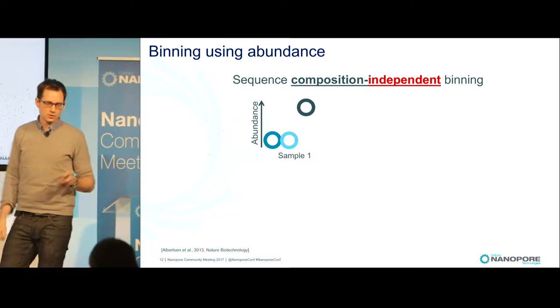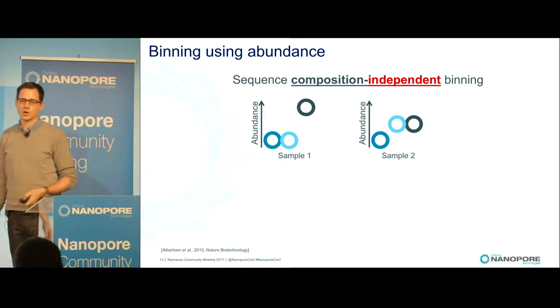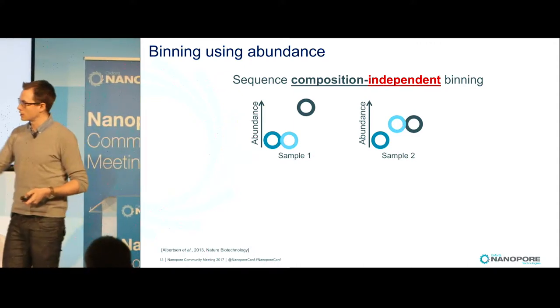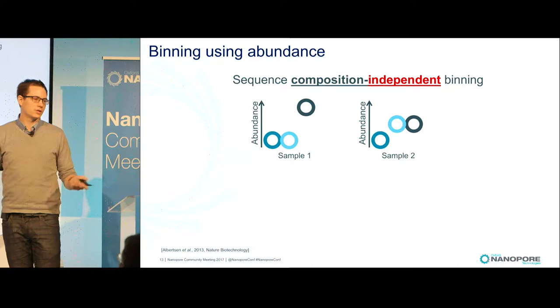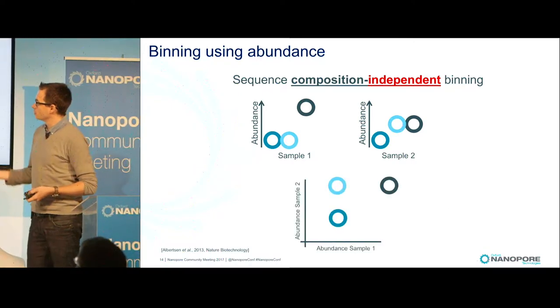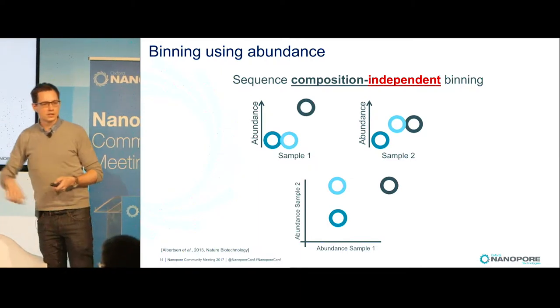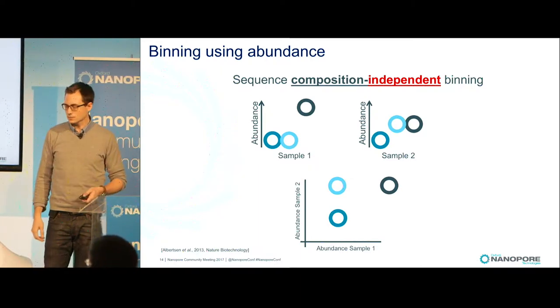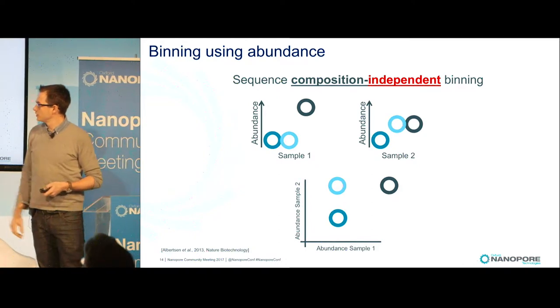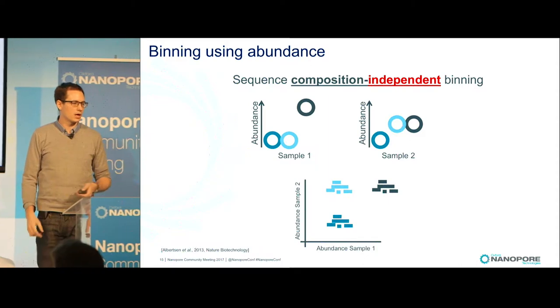They're hard to distinguish. So you make a simple trick. Just take another sample where they are in different abundance. This could be a different time point or just a location nearby or different extraction methods. Just generate differential coverage. Then you combine these two abundance informations, and now you can actually separate the genomes out quite easily. Now, it's not complete genomes yet. It's often small pieces, but you can actually collocate them and figure out what belongs together.